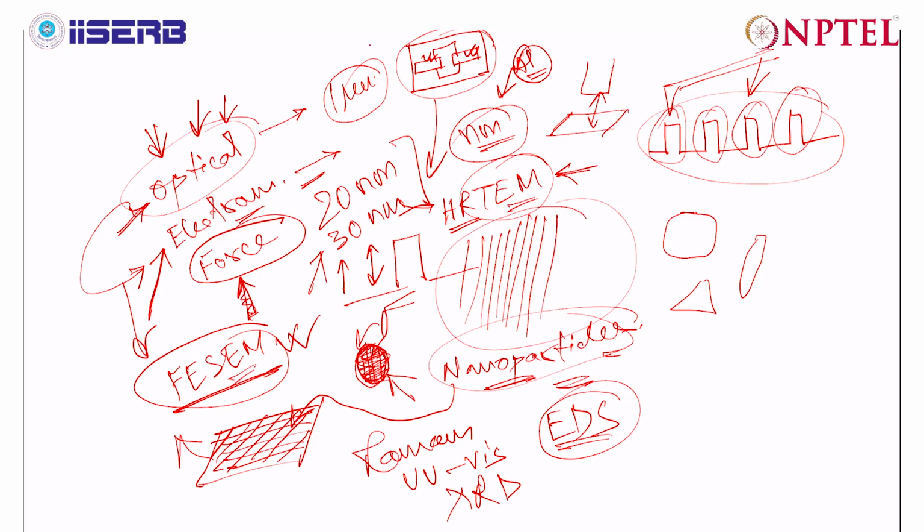So once you do morphological analysis, then and there you can check the elemental composition of the material present on that particular device at various locations. So that is one way to do both the things together. You can do an EDS analysis to cross check whether the material you intend to deposit or put in your device is there, or it is contaminated or oxidized. Whatever is the situation, you can check using that analysis.